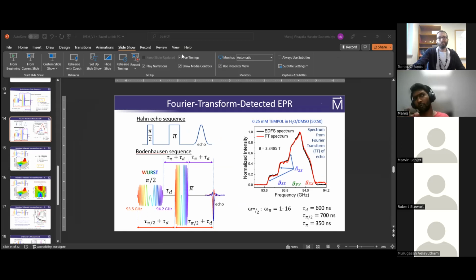But just to add on this, I have done it on gadolinium on a single crystal, where you have nice 7 transitions, and we have seen those 7 transitions, but the intensities do not agree with the field swept spectra.